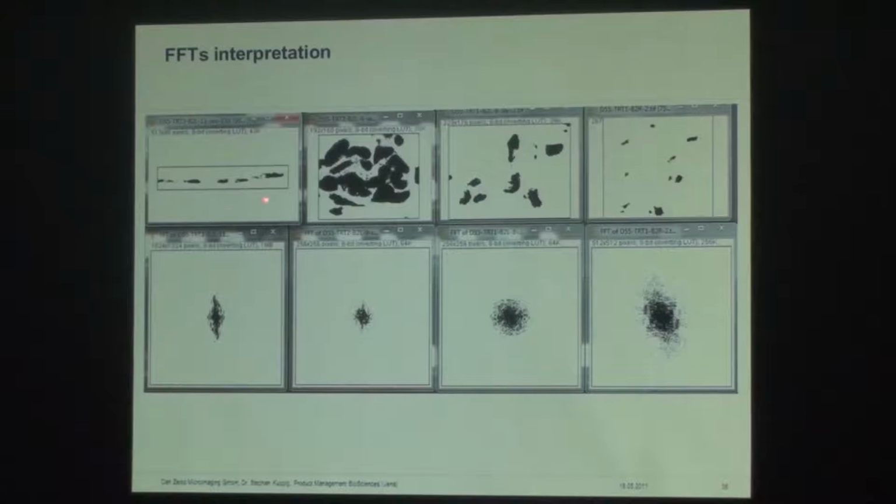We use it particularly with Professor Kimani in collaboration, and I have learned that from him. We use it typically for understanding orientation, frequency, and the angle of objects and shape in an image, which you cannot easily discern with a spatial domain image.